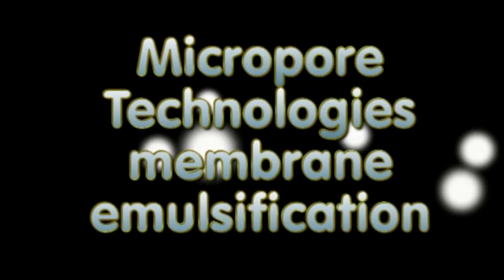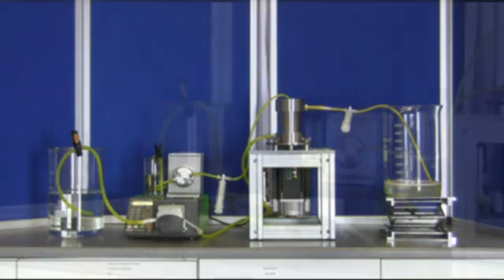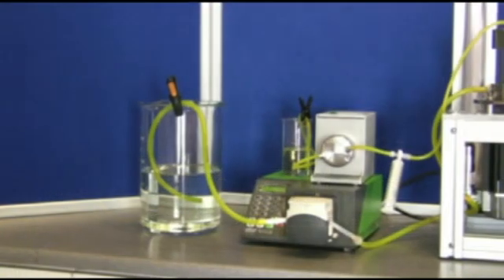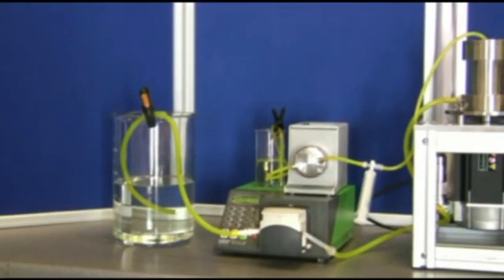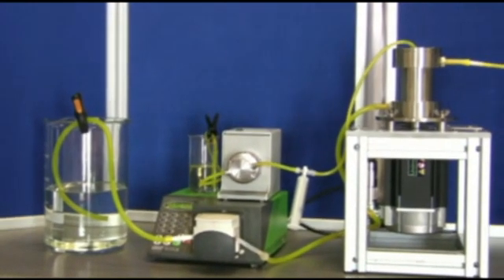This is Micropore Technologies' membrane emulsification and the oscillating membrane emulsification laboratory setup. You can see a feed tank containing water, two pumps, a peristaltic pump and a gear pump.